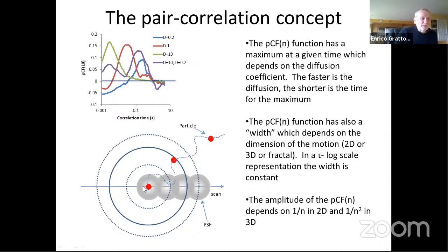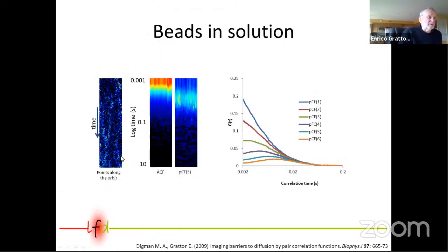Okay, so let us see how many particles I will measure. I will measure a particle with a probability given by the ratio of how big the point spread function is with respect to the length of the circumference. And if you look at it like that, that means that the probability here will depend on that ratio. So particles will leave different regions, but I will miss them. But in 2 dimensions, for example, I should be able to measure all of them. Okay, so that will be important later on.